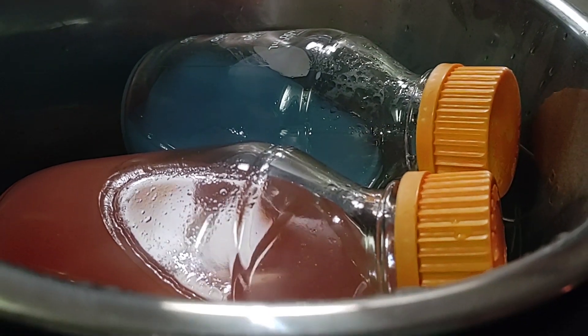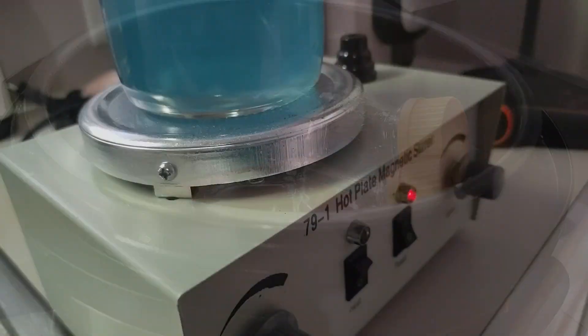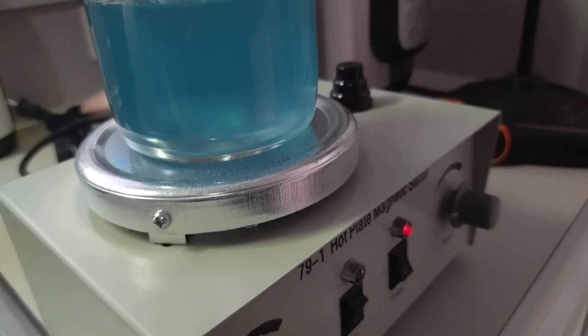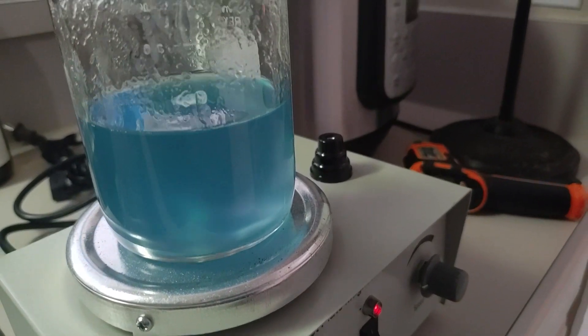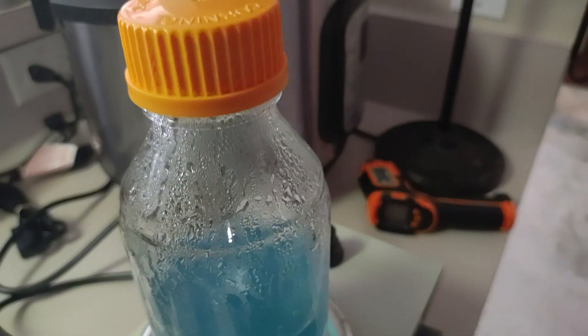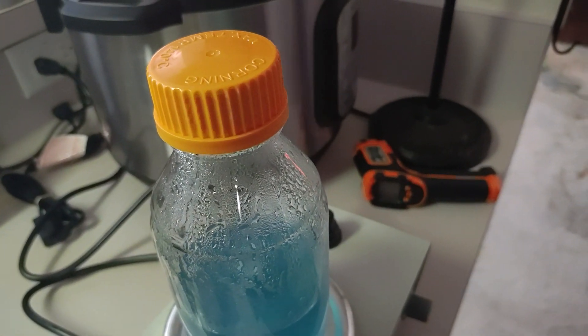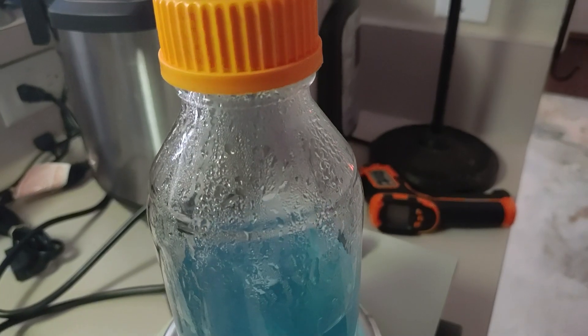You will want to pressure cook for 20 minutes at 15 PSI, then allow the bottles to cool between 140 and 120 degrees before pouring your dishes. We allow our bottles to cool while stirring on the magnetic plate with the heat off and monitor it with the temperature gun.